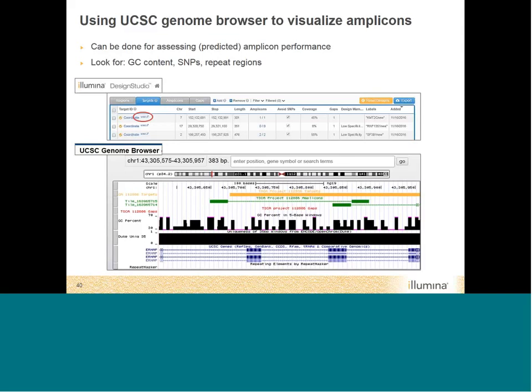What I think is really neat is you can see there's a thick part of the Amplicon and then a thin part. The thick part corresponds to the probes, and then the thin part is that region that is added through extension ligation between the probes. What you'll also see here in this particular example, the orange region is larger than what can be spanned by one Amplicon. So you'll see there is some tiling going on, so you have two neighboring Amplicons.